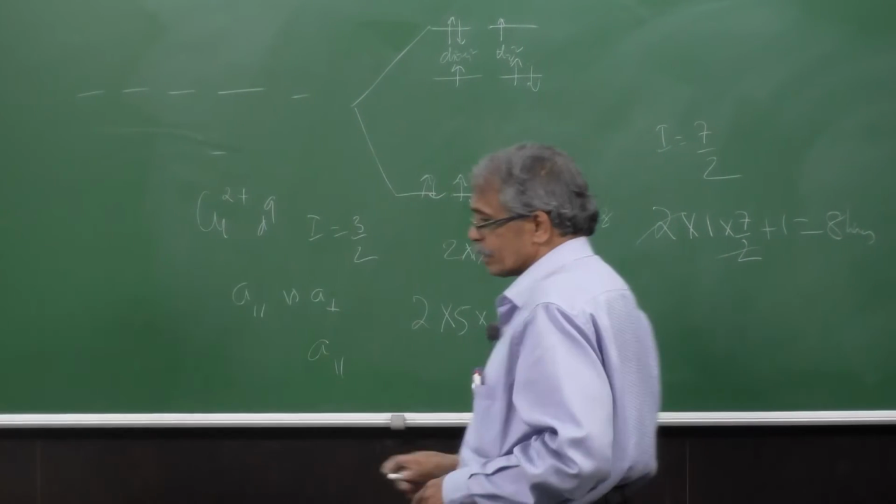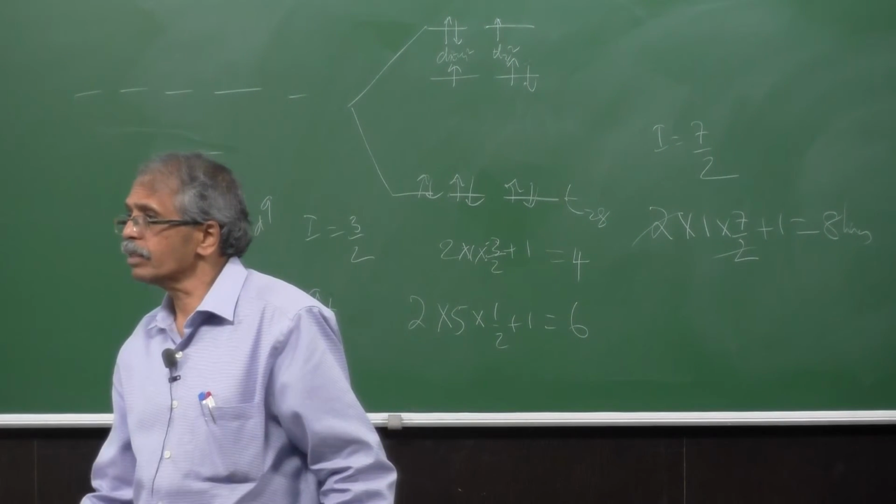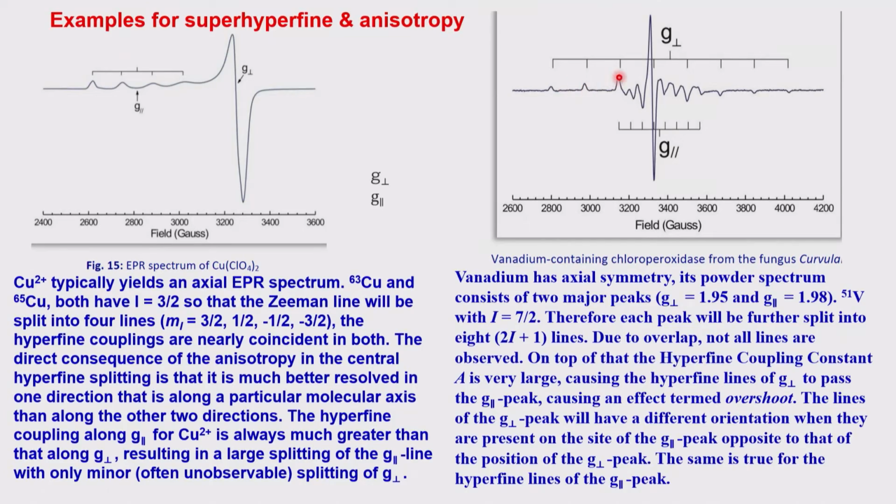If you look at the spectrum obtained here, it's 1 2 3 4 5, there is one more here, 6 7 8 9 10 11 12 13 14, something like 15 16 are there. So obviously this is not coming from just the one alone. If it were one alone you would get 8 or lower but not higher. Here you are seeing almost double the number of peaks.